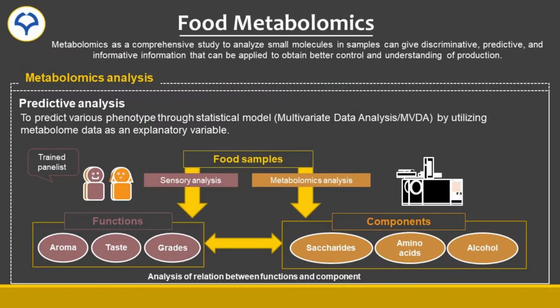Food metabolomics in Fukusaki Laboratory focuses on analyzing small molecules such as amino acids, sugars, organic acids, and many more to understand about the food production and processes. Such analysis can give discriminative, predictive, and informative informations to both food industry and consumers.